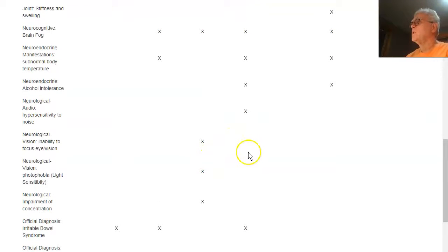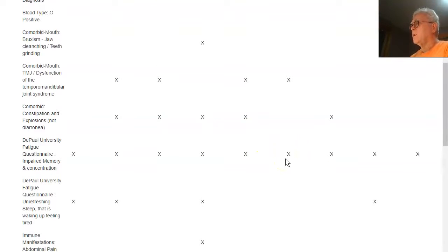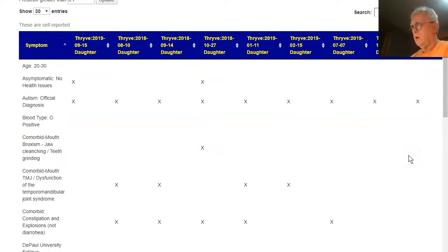Other things are singletons, which means it's probably just a temporary variation of bacteria that happens to match things, and then upward you see other things are pretty consistent across the board.